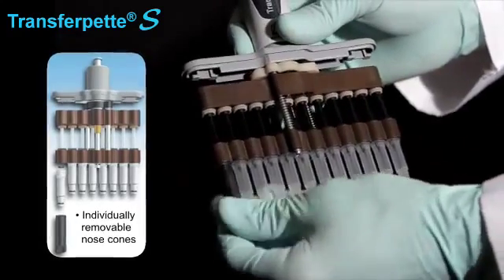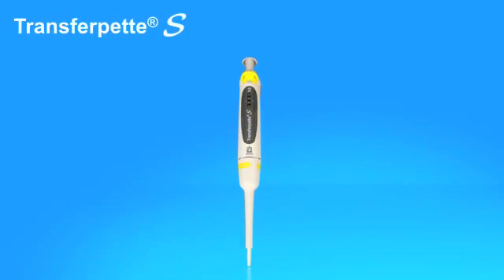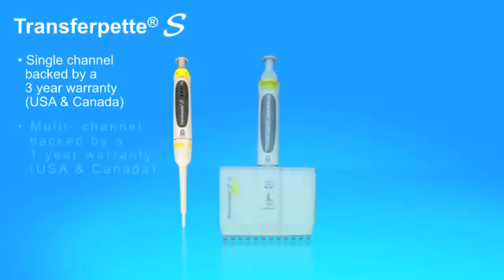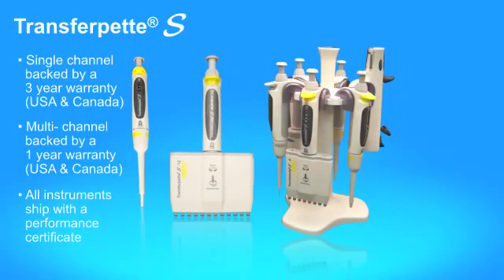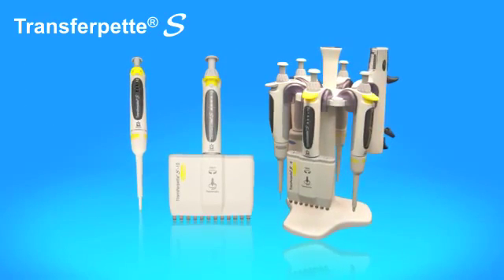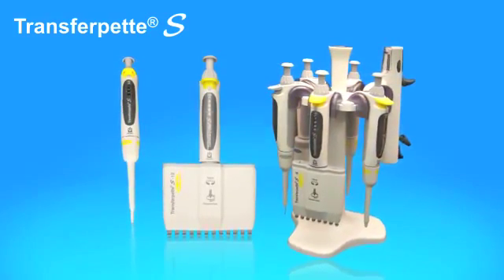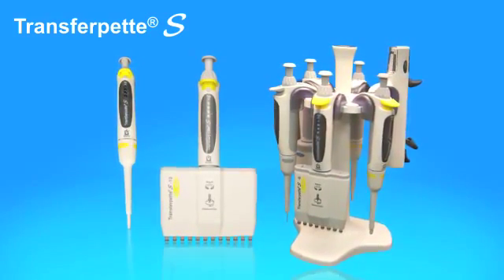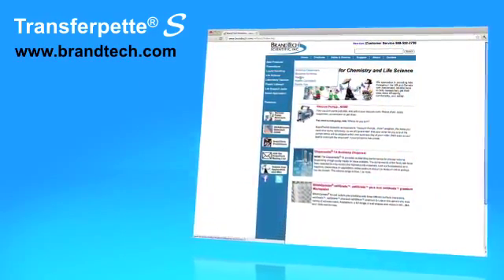The Transferpette S single channel pipettes are backed by a three-year warranty. Multi-channel models have a one-year warranty, and all instruments ship with a performance certificate. Innovative design features, advanced materials, comfortable and easy to use—the Transferpette S sets a new benchmark for pipettes. For more information, visit brandtech.com.